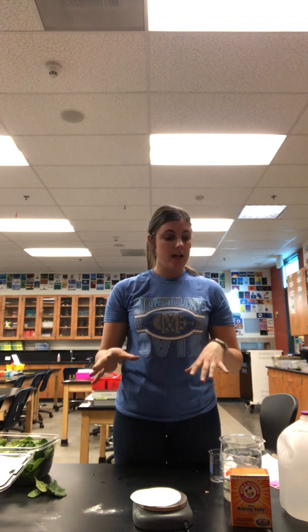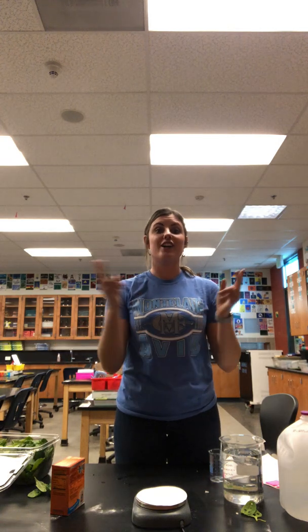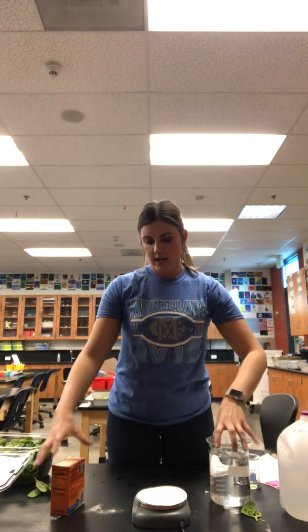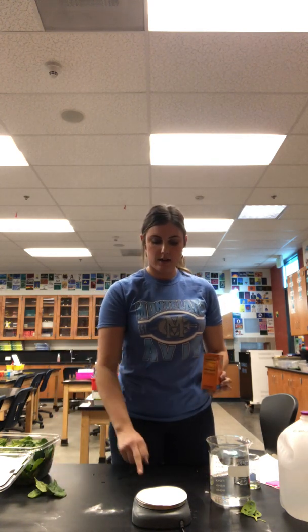In today's lab, we are going to begin by measuring out our sodium bicarbonate and making a sodium bicarbonate water mixture. The reason we're doing that is so that we have that water and carbon dioxide source so that we can drive photosynthesis in our reaction. I already have my 1,000 mils of water measured out. I am then going to measure out my baking soda to pour into my water.